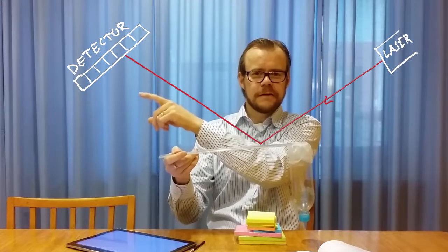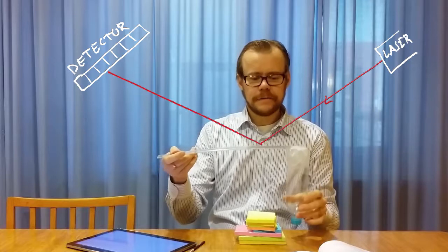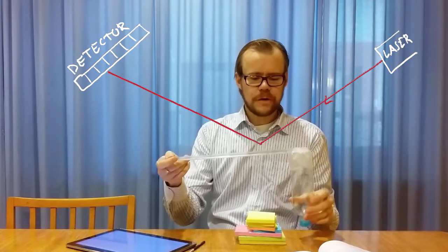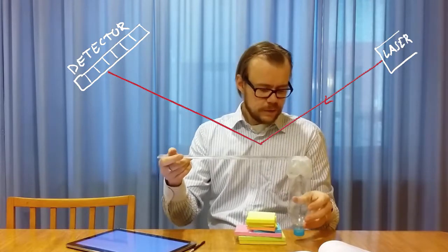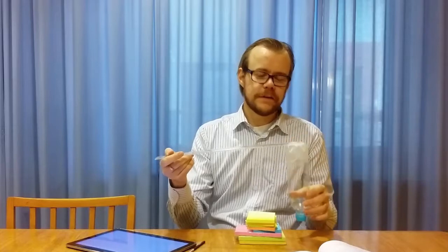And then that change in location will be directly proportional to the force on the cantilever. So then we can measure the force. So in atomic force microscopy you have this laser geometry setup that measures the deflection of the tip when you scan. So then you know how to measure the forces with the machine.